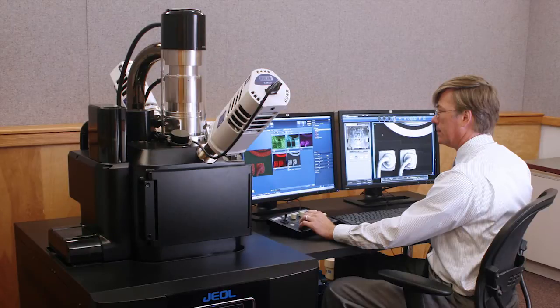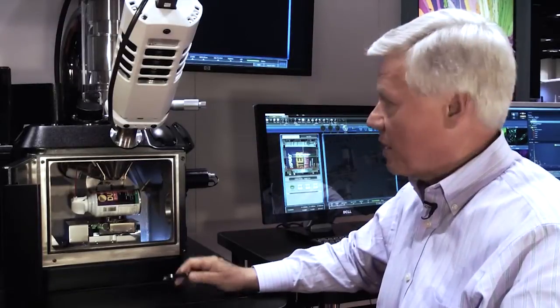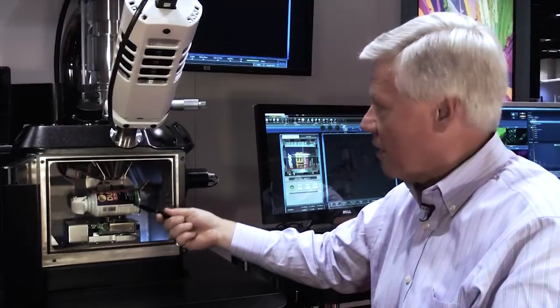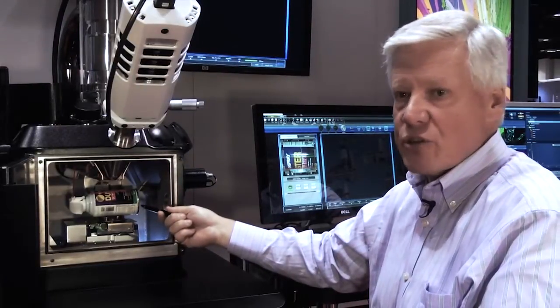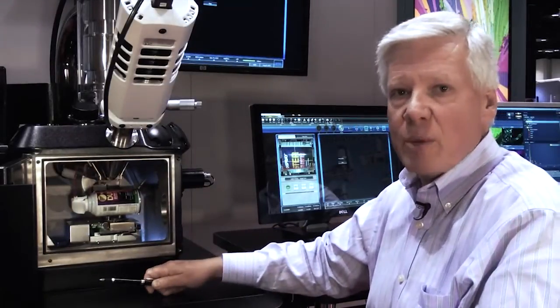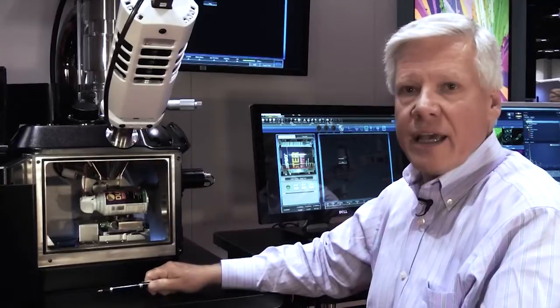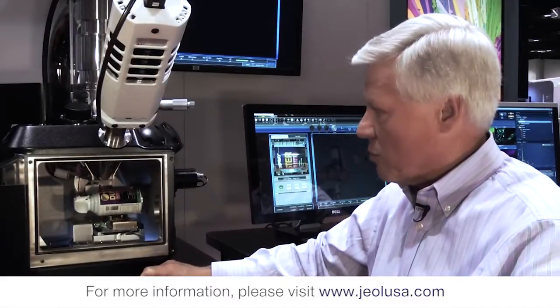We'll open up the specimen chamber and give you a look inside, giving you a sense that the stage and chamber are robust and capable of handling large, heavy samples. JEOL continues the tradition of the in-chamber stage — real-world samples tend not to be small, flat, or regular in shape. Here's an example we're using as a fiduciary: a can of spray air. With the stage in place, we can drive to a location with the door open — something impossible on microscopes with stages on rails that draw out. We're able to navigate on traditionally very difficult samples. The large specimen chamber is just a continuation of the capability JEOL has provided for years.